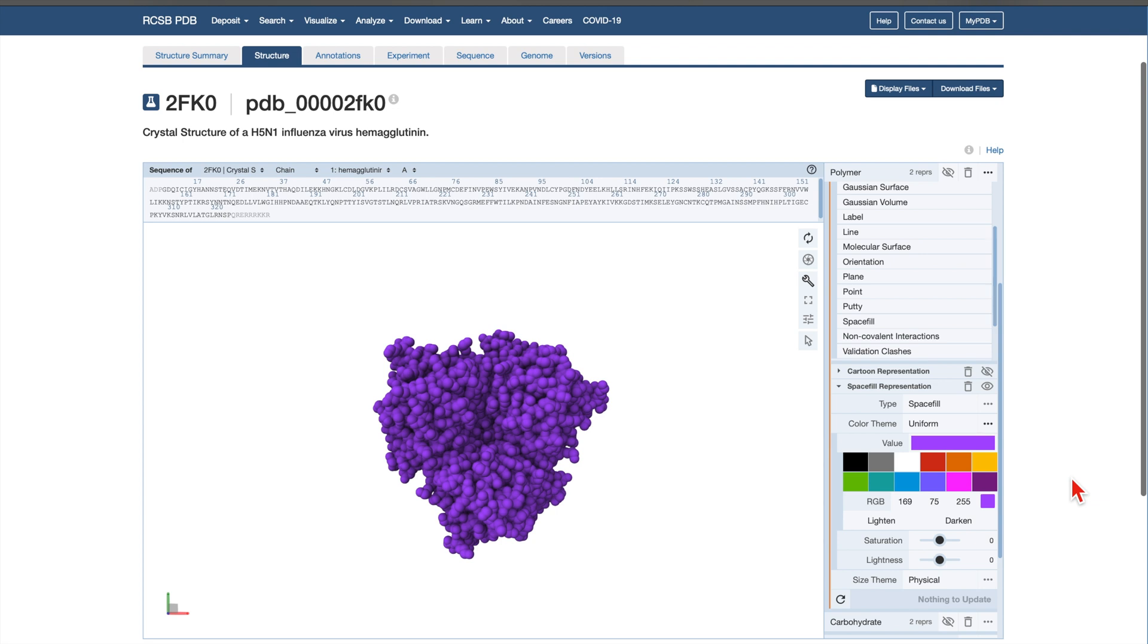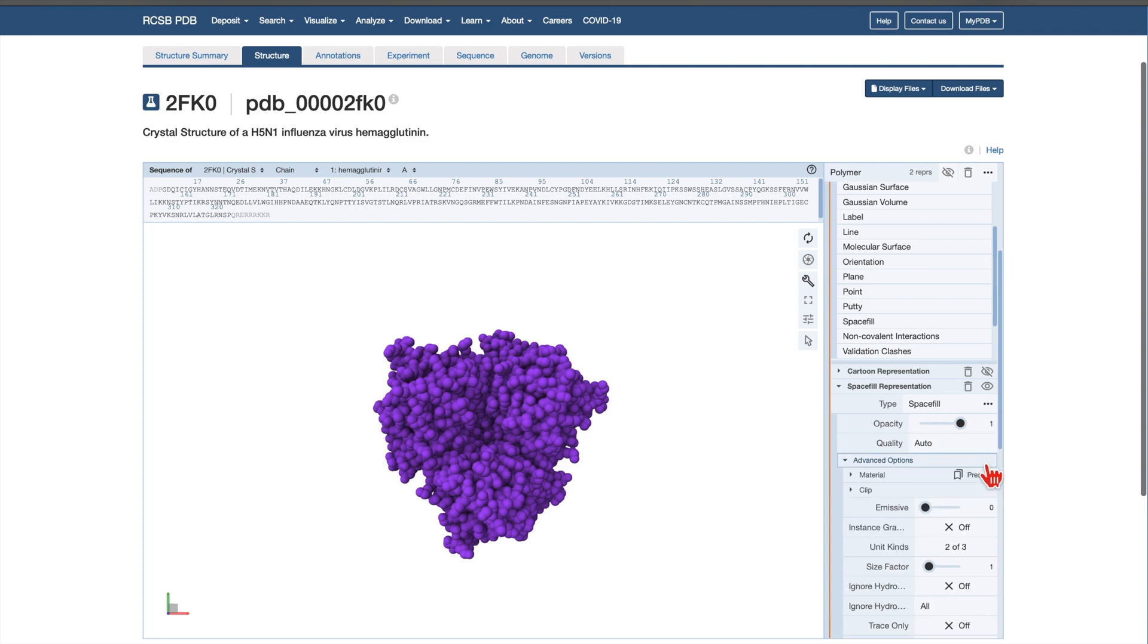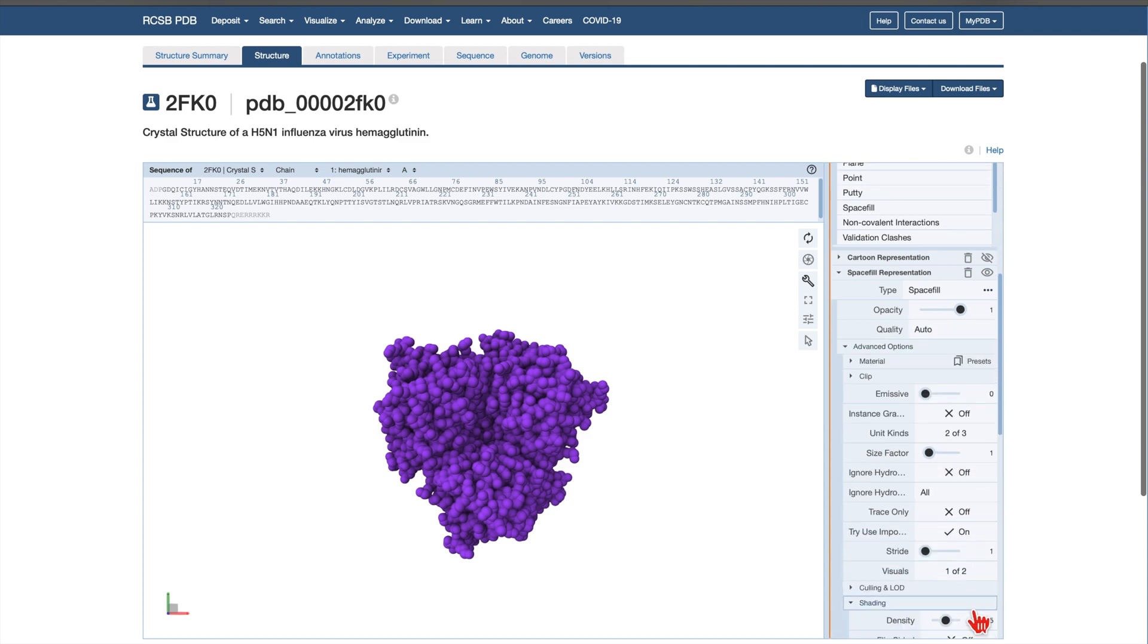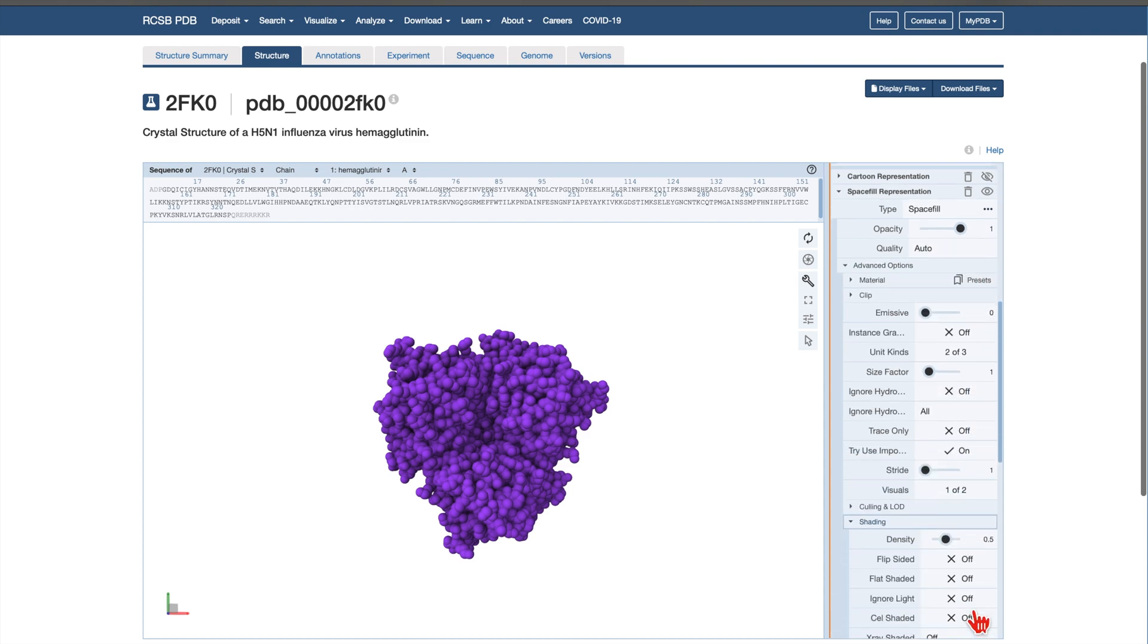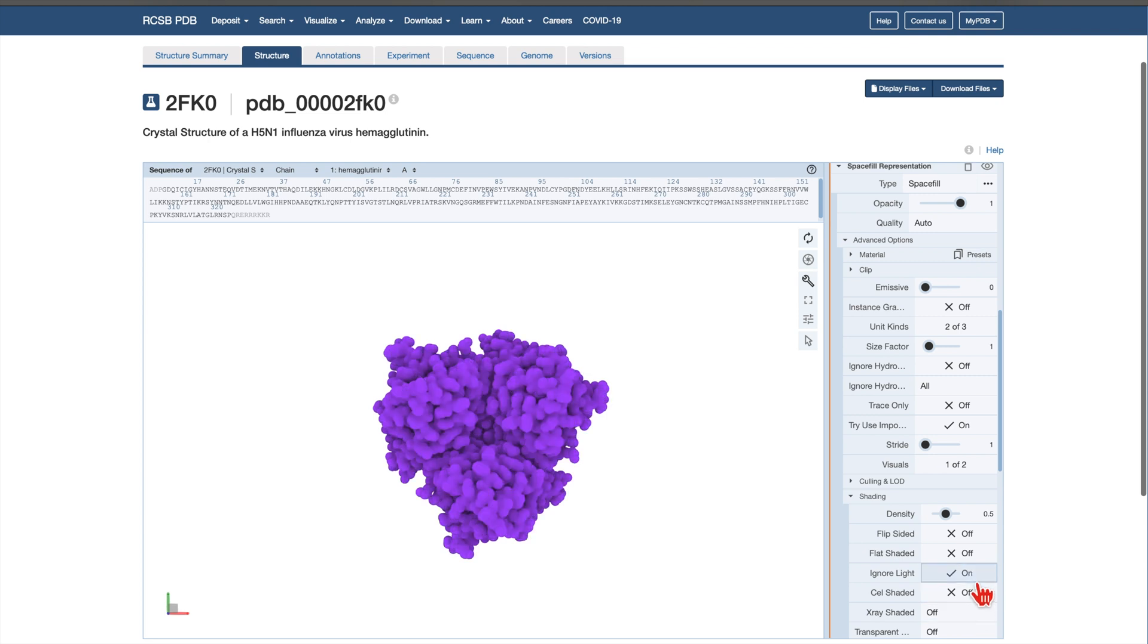To create a more illustrative effect, click the three-dot icon in the Type section. Go to Advanced Options, then scroll down to Shading. Next, toggle the Ignore Light option to On. This flattens the shading and removes realistic lighting.